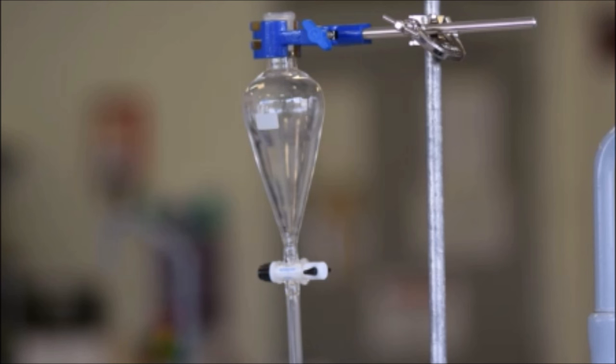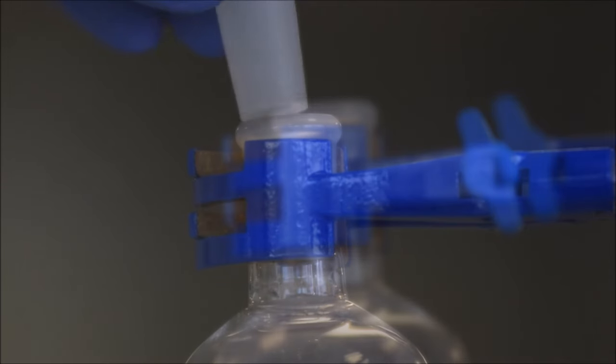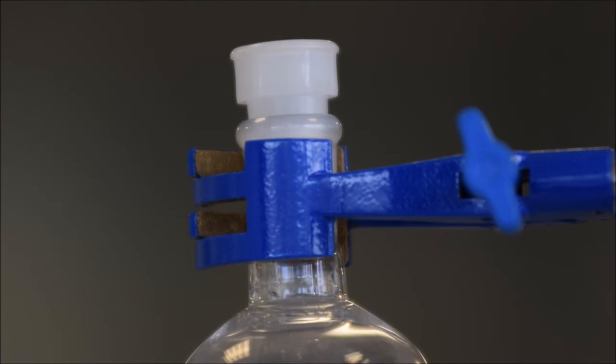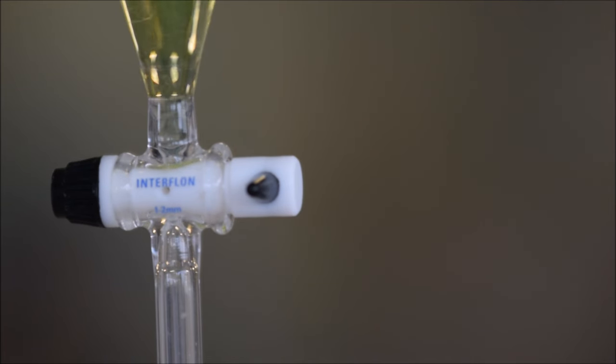So you clamp it around the neck and make sure that the upper lip on the top of the neck sits above the clamp. Don't clamp it any other way, as you're just asking for it to break. And that's where the stopper goes in too. At the bottom is the stopcock, and that controls the flow of liquid out of the funnel.